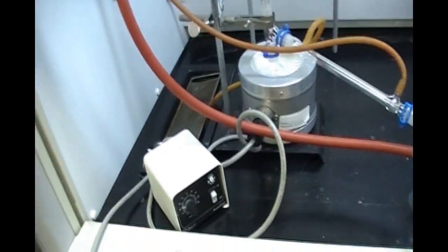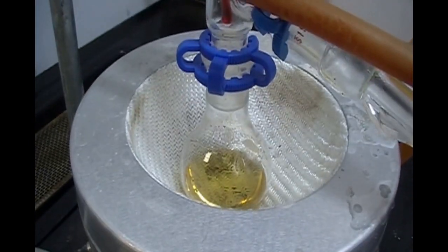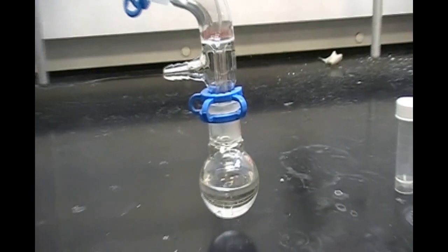When setting up, make sure that the thermometer is pushed down far enough into the setup to obtain an accurate reading. If the reading is off, the product will not be as pure. We collected in a 25 milliliter round bottom flask. We continued the distillation until there was little to nothing left in the initial flask. Here we see our final product. Smells like banana.